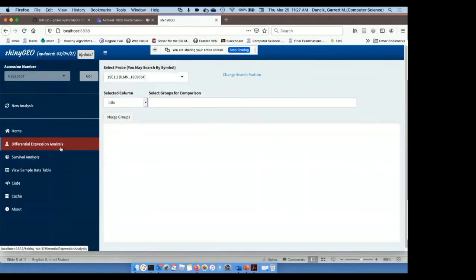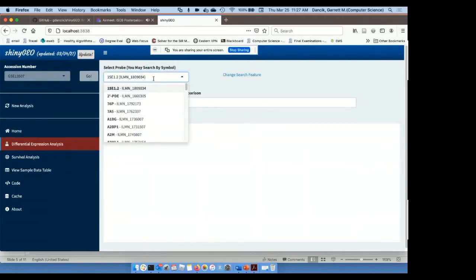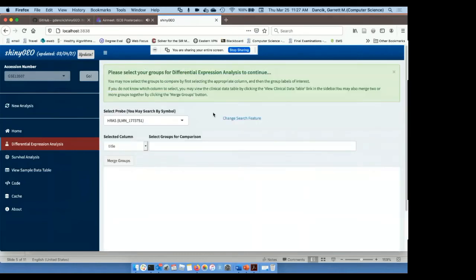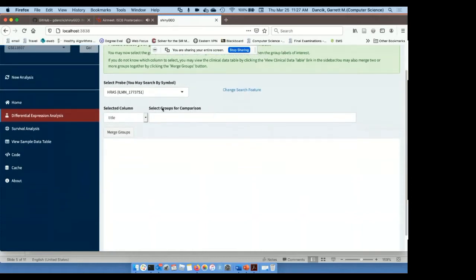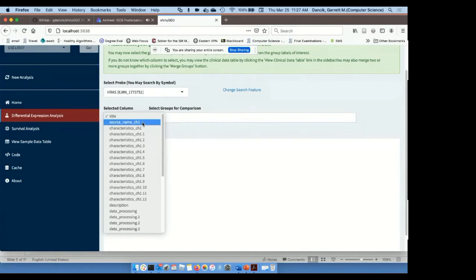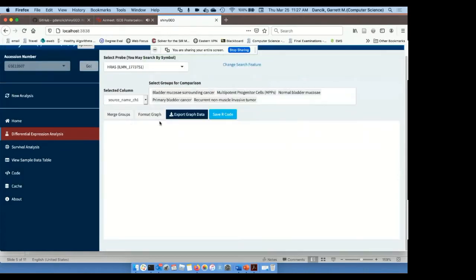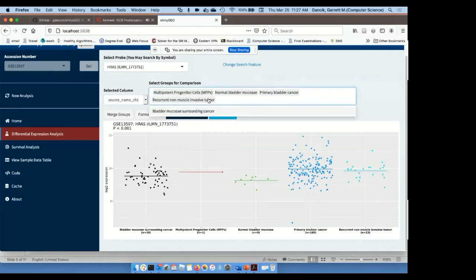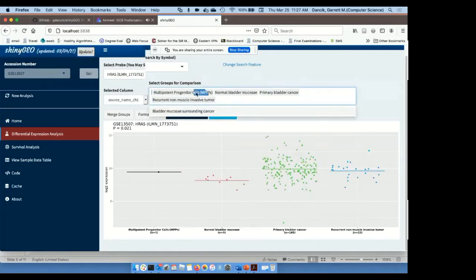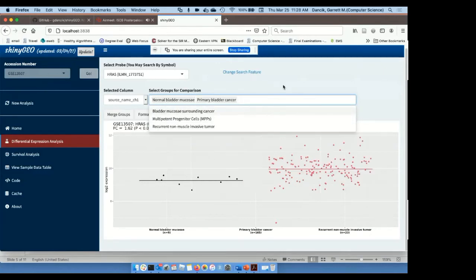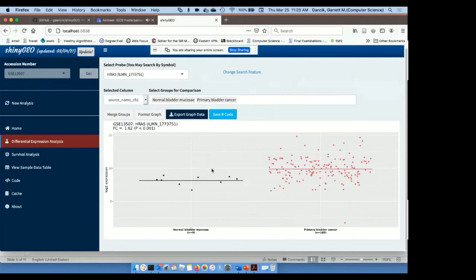For the differential expression analysis, we select the gene that we're interested in. I'm going to focus on HRAS. HRAS is a proto-oncogene gene that's frequently mutated in bladder and other cancers. So I've selected that gene. Next, I need to select the column that contains the group information that I want to compare. In this case, it's the source name column. This column actually has more groups than what I would be interested in, so I'm going to remove some of these. As you see, the graph is going to update dynamically as I'm adding or removing groups.